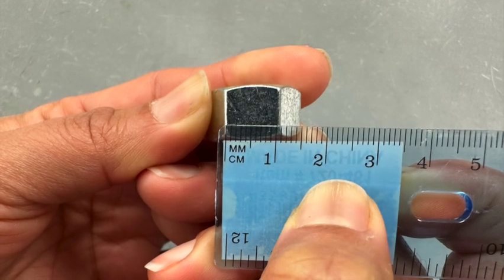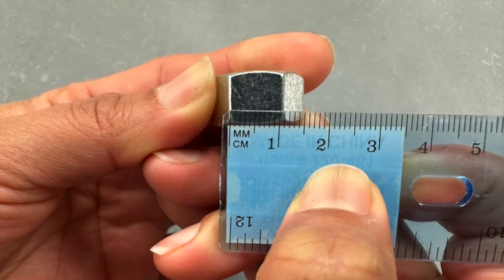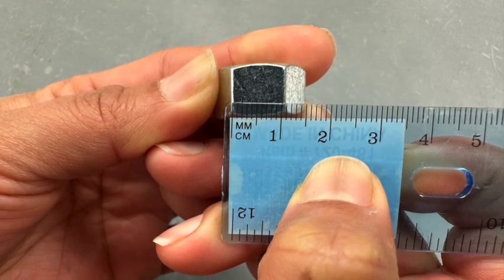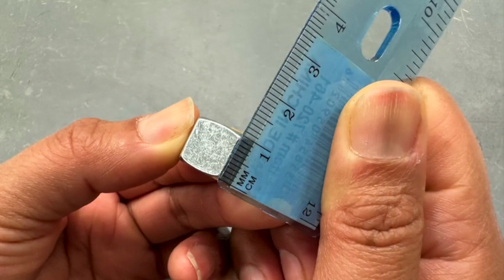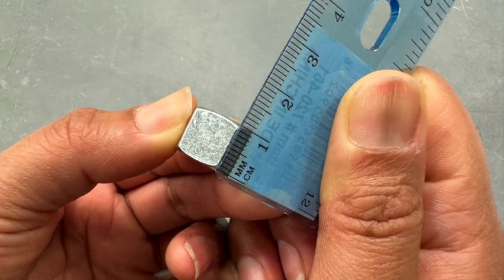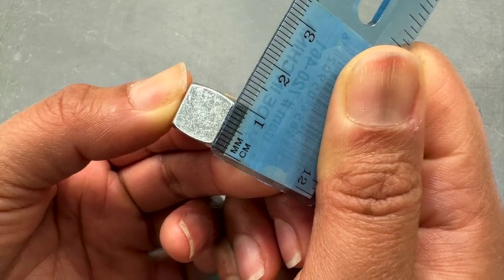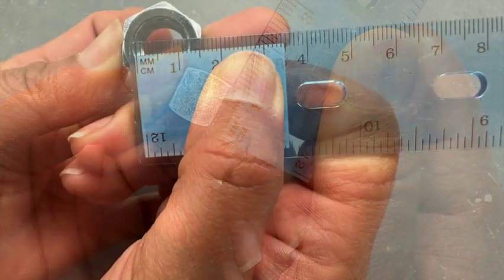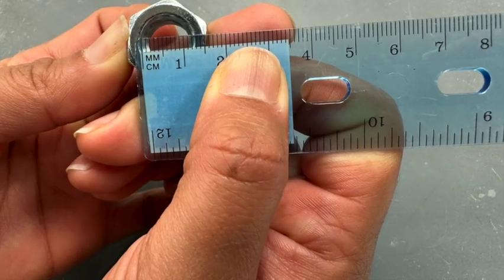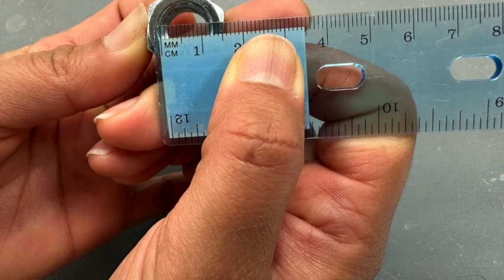The direct measurement of the solid will depend on the shape of your solid. Here we have a hex nut — its shape is a hexagonal prism. To find the volume of a hexagonal prism, measure its base and height. The hole in the middle of the hex nut has the shape of a cylinder. To find the volume of this cylinder, measure the height of the cylinder and the radius by measuring the diameter of the hole and dividing by 2. Then subtract the volume of the cylinder from the volume of the hexagonal prism.